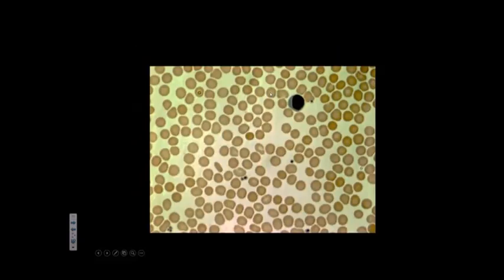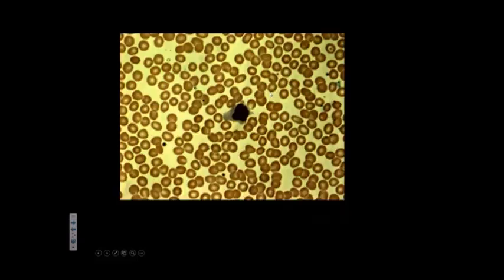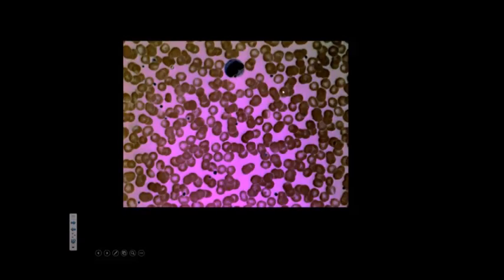So what do we call this one again? Lymphocyte, you're getting it. Last time we went with basophil on that one, okay? And this one would be lymphocyte, monocyte, potentially a, I don't see any cytoplasm. Oh, no, I thought you were talking about basophil. Okay, so this one's kind of boogered up, but it is a monocyte. This one is really, really big, kind of lobulated.